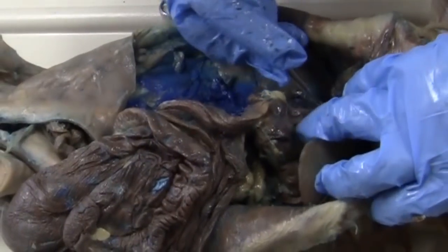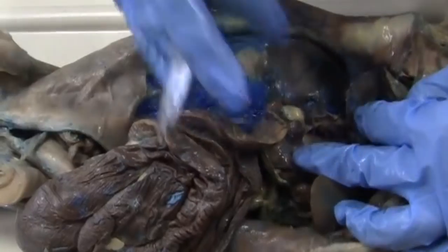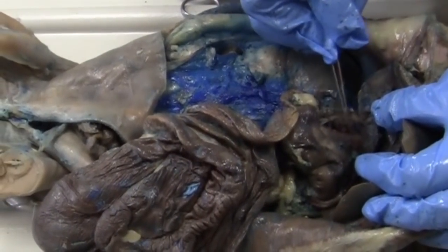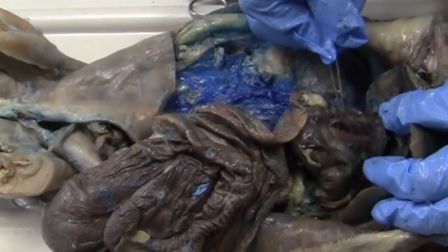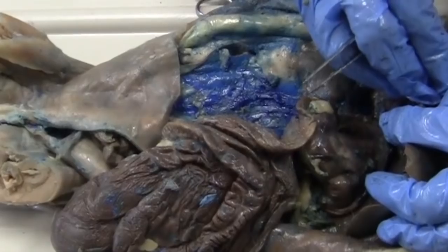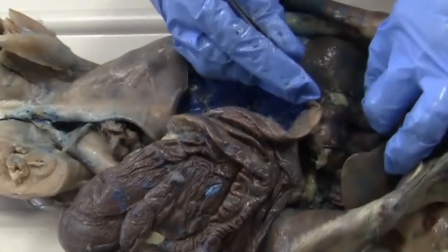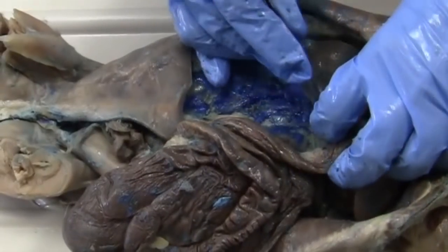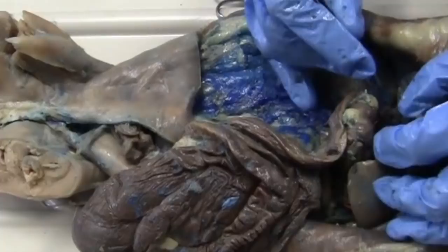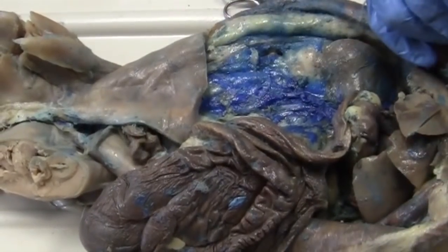It's the stomach. Okay. So hopefully you can see that right here, how this is all blue. That's the portal vein. So once again, carrying blood from the intestines into the liver where it gets filtered. And don't mistake this for the caudal vena cava. That's pretty common because they both run on the back side here. So portal vein to the liver, caudal vena cava to the heart.